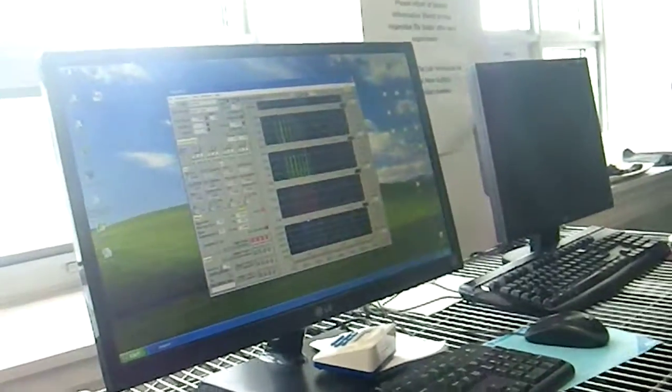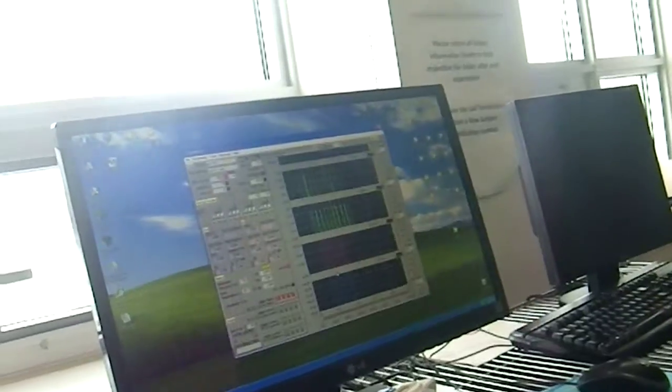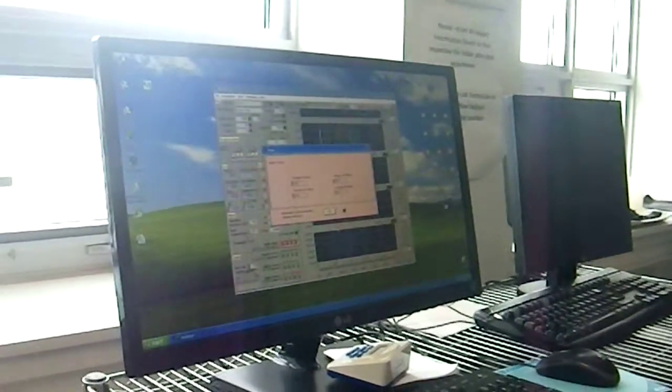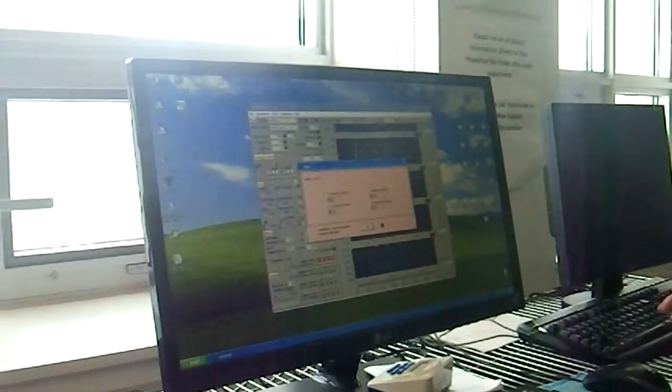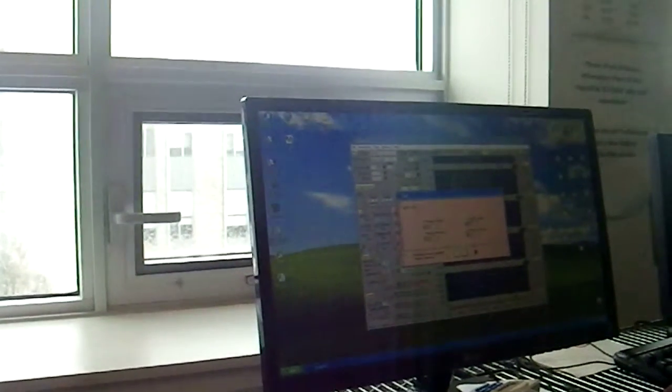And you want to make sure you do this at different velocities. That way, the computer gets an idea of the different flow rates, and it will have a correct measurement altogether. So hit OK. This light here is still dark.